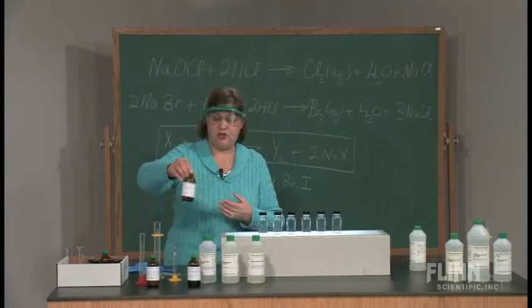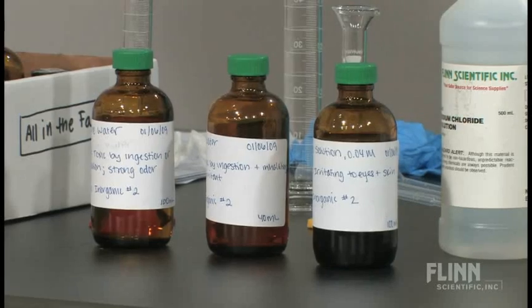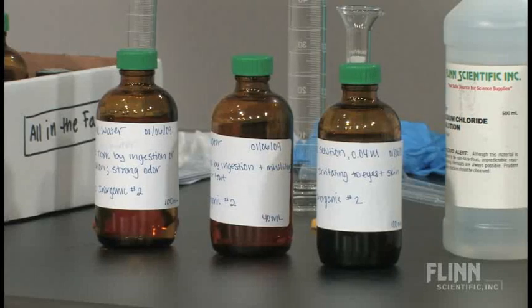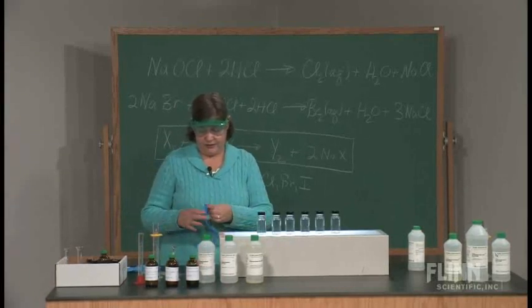So even if you're freshly preparing it, take the time to prepare a label for it, and you can make just as much as you need for one demonstration or 4 demonstrations, whatever it is. So I'm going to put on some gloves here.